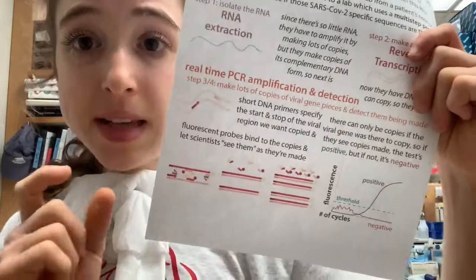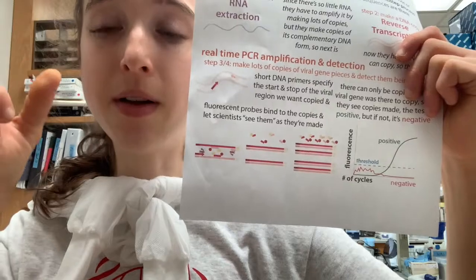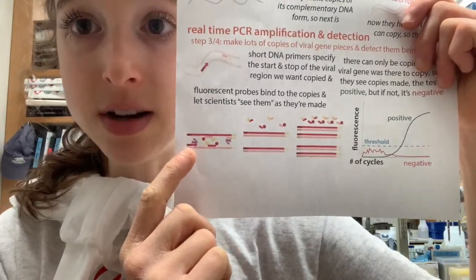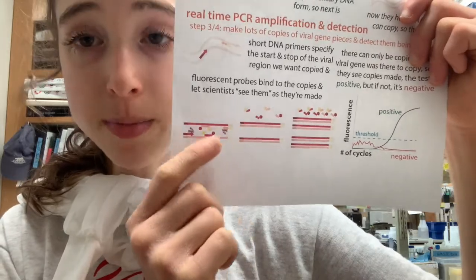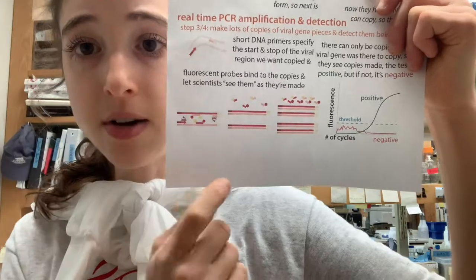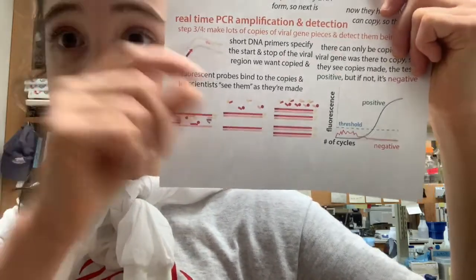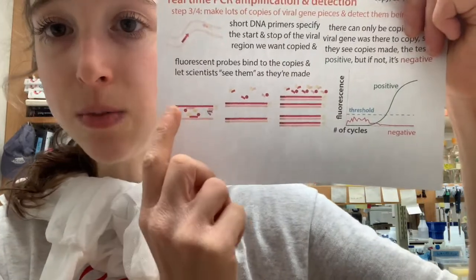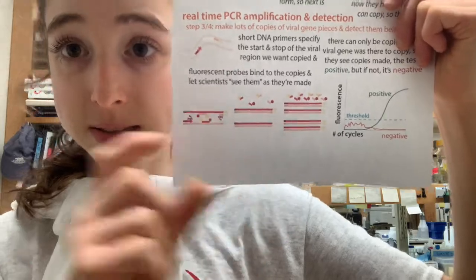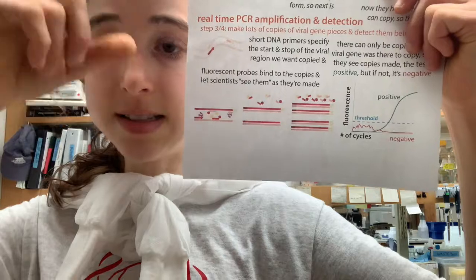And the thing with PCR is you specify what region you want to be amplified. By amplify, we mean copy. Basically you use these short pieces of DNA that can stick on to longer pieces of DNA. And then this molecule called DNA polymerase, one of those enzymes I was telling you about, can copy from DNA to DNA. It's going to bind at those ends that you specify, and it's going to copy in between those regions. And it does this in cycles.